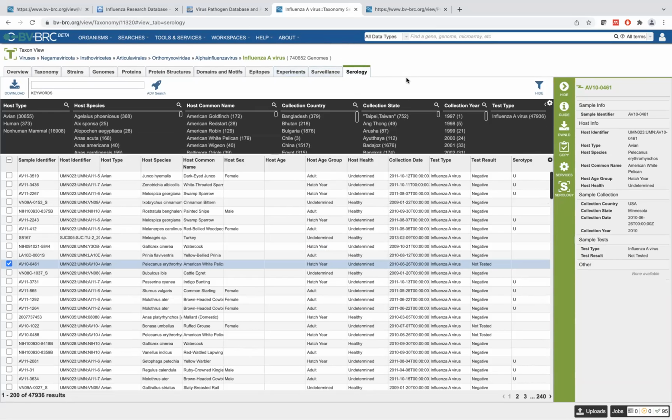Anna, can I ask quickly, how fast is the viral assembly tool? How long does it take? If you're talking about SARS-CoV-2, it's relatively quick because it's reference-based assembly, and the majority of reads that people upload are from amplicon-based sequencing.